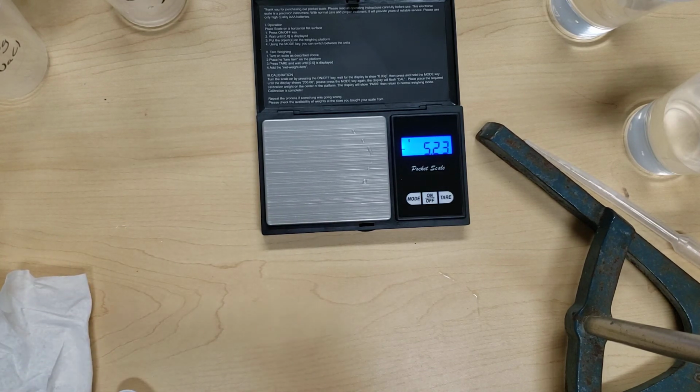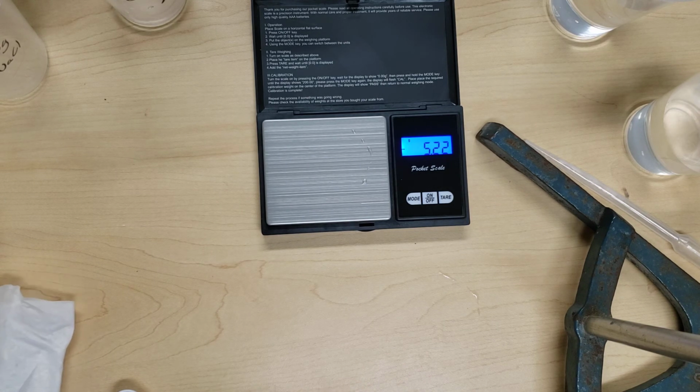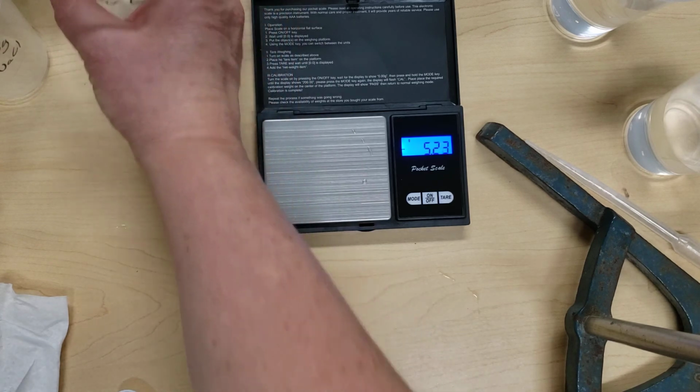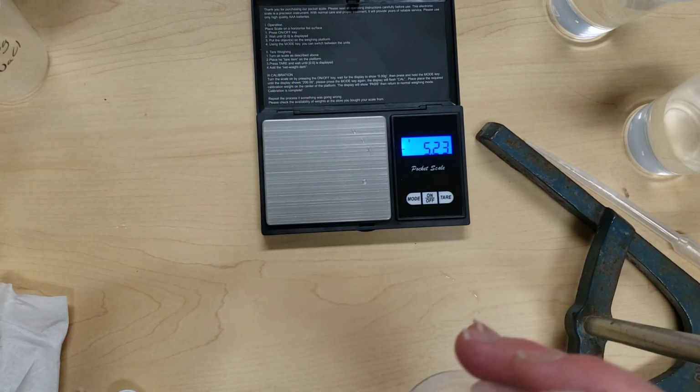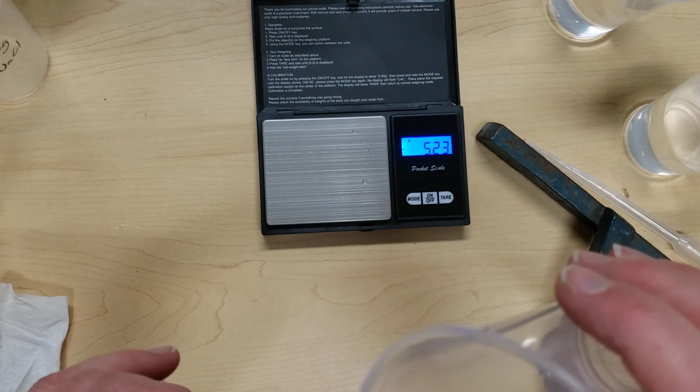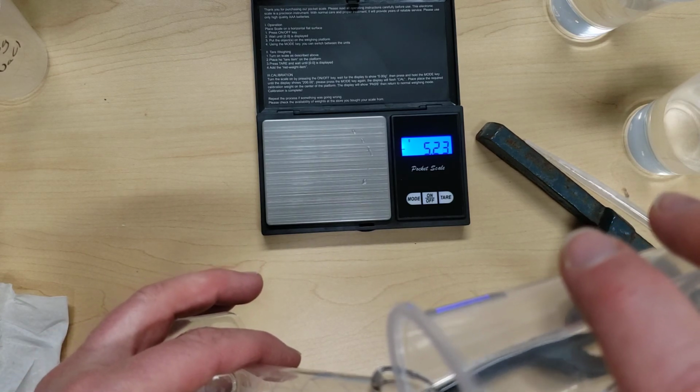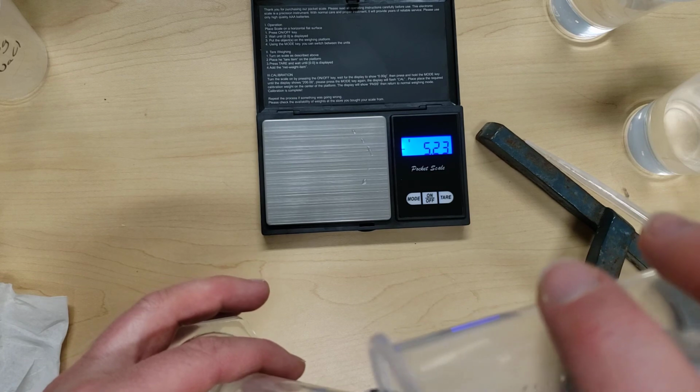So you want your clean, dry graduated cylinder. We're going to pour in the solution that we made, starting with 0 grams of NaCl.